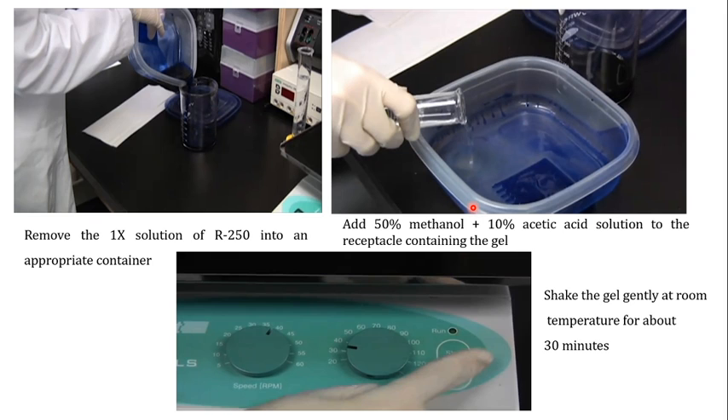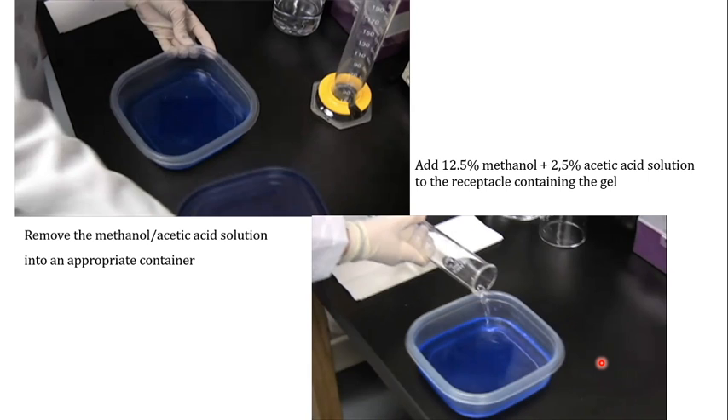After incubating the gel in the 1x R250 solution for one hour with shaking, remove the staining solution into an appropriate container. Then add a de-staining solution of 50% methanol and 10% acetic acid, and shake the gel in this solution at room temperature for about 30 minutes. After 30 minutes, remove this methanol/acetic acid solution into an appropriate container.